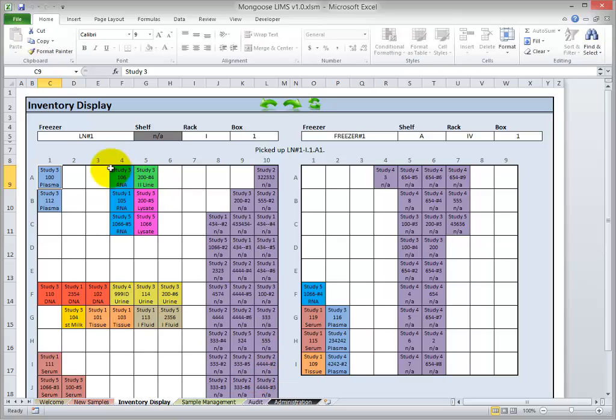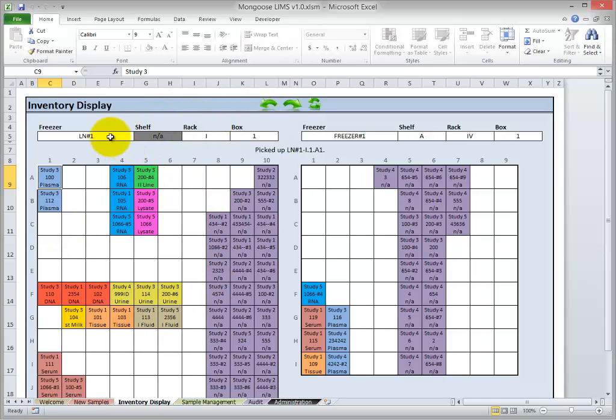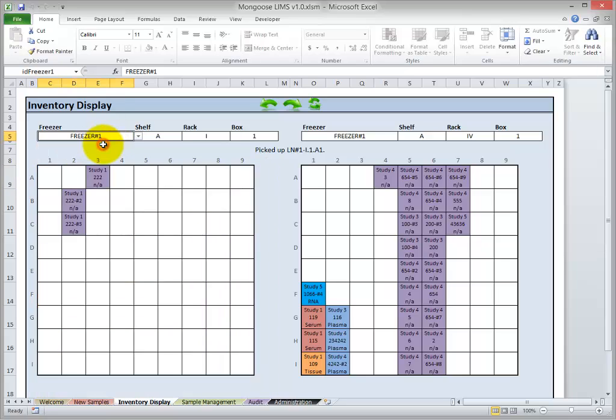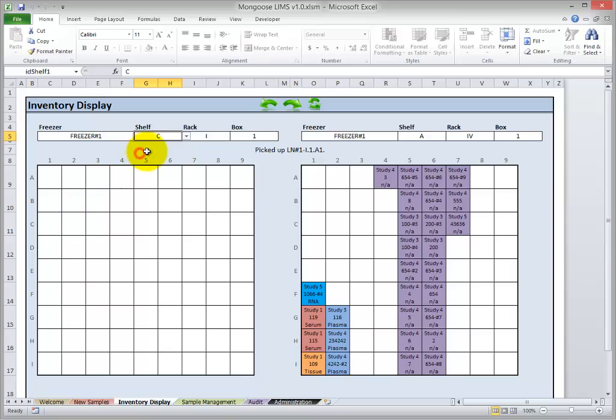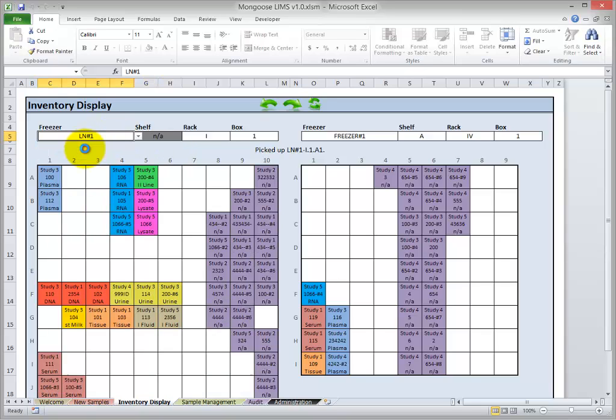So let's start at the top here. This is where the user selects which boxes they would like to view. The locations are broken out into components: freezers, shelf, rack, box, and then the cells within each box. So we can view a box in another freezer by selecting here. We can view a box in another shelf by selecting here. Pretty straightforward. Let's go back to the Liquid Nitrogen now.